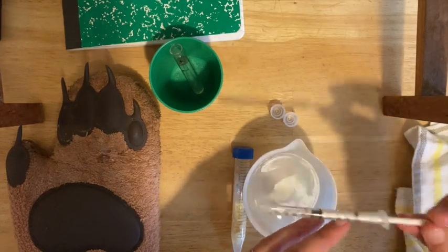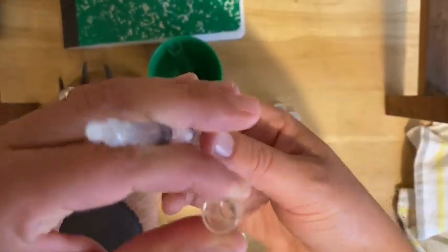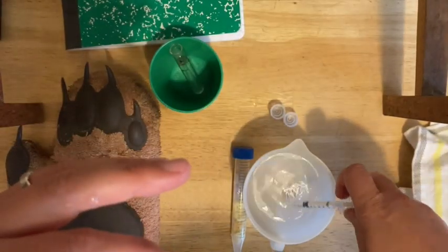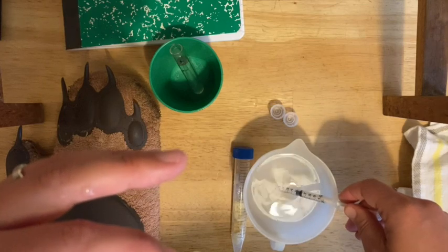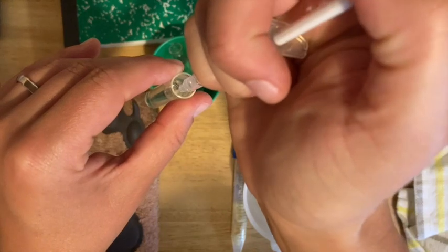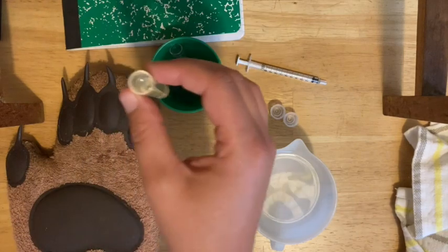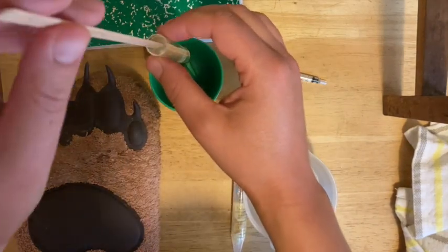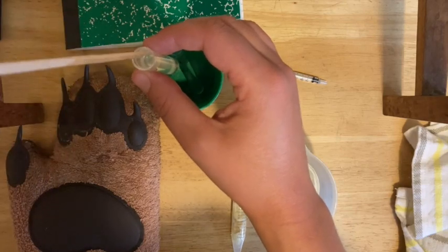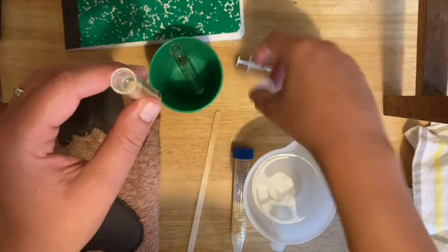If you've got any bubbles, flick it to bring them to the top, push out any bubbles, then draw back up a little more so you have exactly 0.5 milliliters. Squirt that into the minus C tube and stir with a wooden stir stick. Be gentle so you don't spill anything. Then put the cap on and stand it upright.